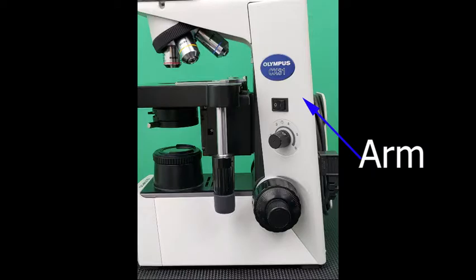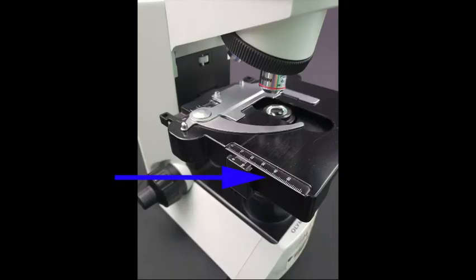Arm: The vertical, usually curved or sometimes straight part connecting the head to the base of the instrument. The microscope arm contains the following parts.